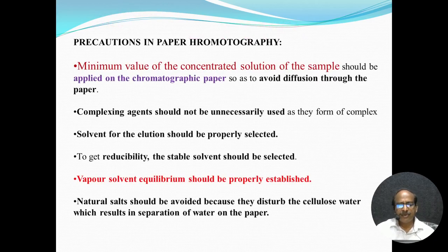With the help of paper chromatography, we can analyze component separation, and it is very helpful to society. Paper chromatography is the easiest technique, a versatile technique with wide applications, which is why we use it.